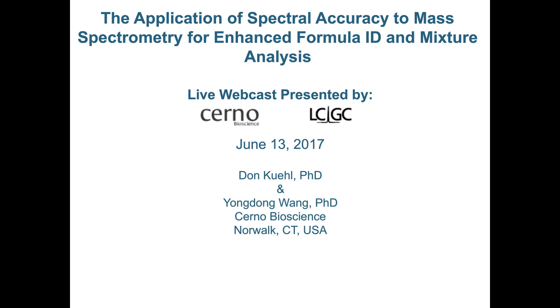This is an area that's very interesting to us. Actually, we believe it does. We haven't really done a lot of work in that area, but having just come back from ASMS and seeing all the interesting papers on large molecules, I think there's a lot of potential that we can bring. I think the current approach of what they call deconvoluting multiple ion species is flawed, and we believe that we could do a much better job of that. So the answer is we believe so. We are just starting to explore that area.